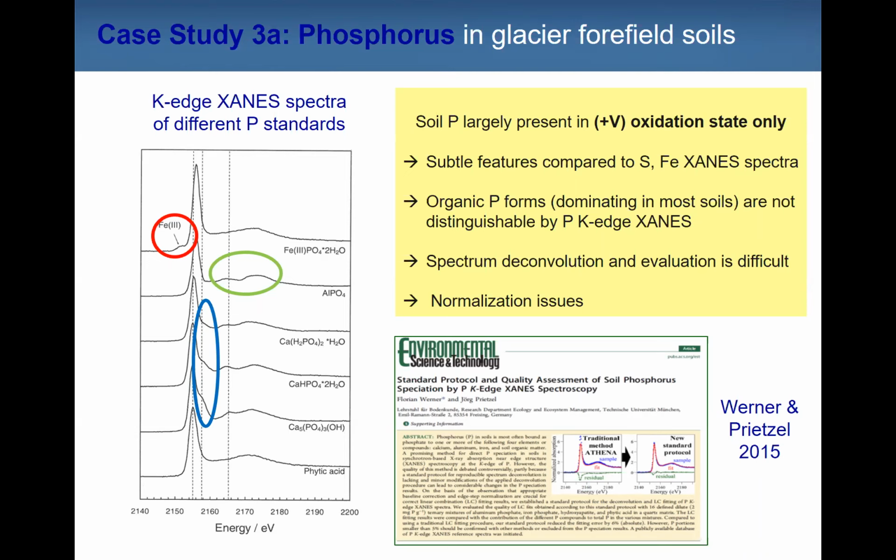And now we can solve the problem of, in a certain sense, subjective normalization. So this is an objective procedure where you can't interfere with your personal feelings. And it ends up, in our mixtures, with a nice representation of the true speciation. So the LCF results represent the true mixture percentages.